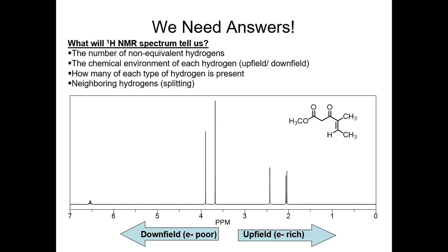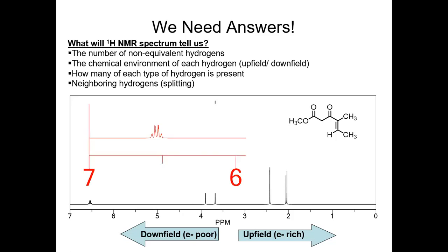You could basically study any nuclei on the periodic table. If it's present, there's a probe that can study it. The probe that we have at Tuskegee is a quad nuclear probe, so it can study 4 different types of nuclei. All you have to do is tell the receiver what experiment you want to run.